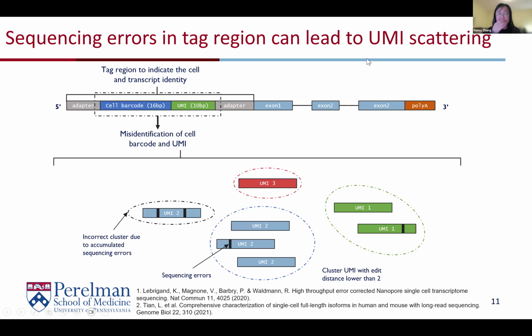First, why is it a source of distress? Why is the UMI barcode more difficult to analyze here? It's because the UMI barcode is a short barcode sequence. In single cell and spatial data, you count the number of copies of a gene by counting the number of unique UMIs. Let's say here you have 7 reads, but you only see 3 different UMIs. Then there are only 3 copies of this gene.